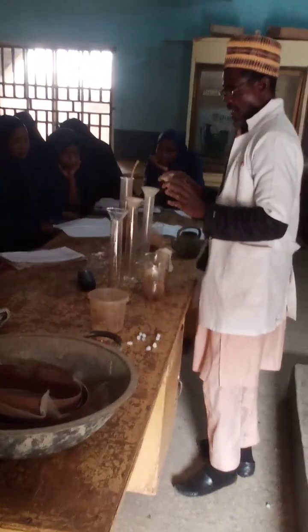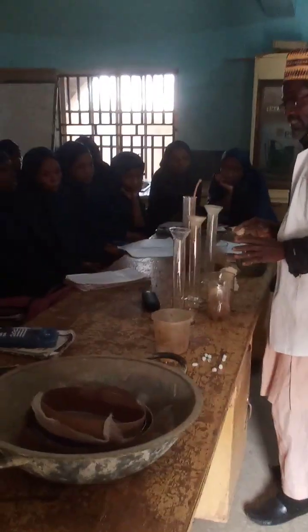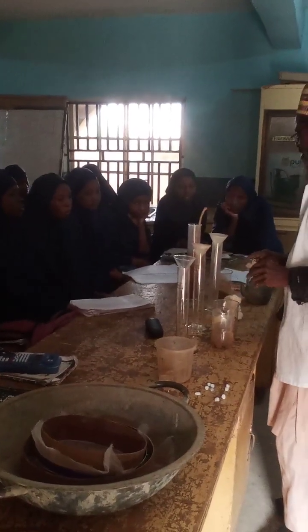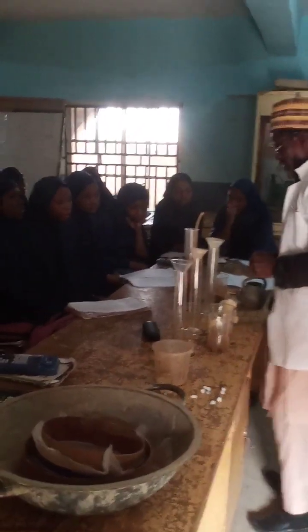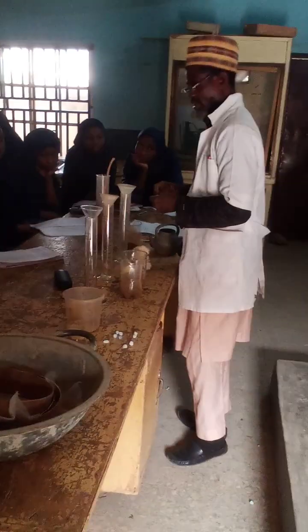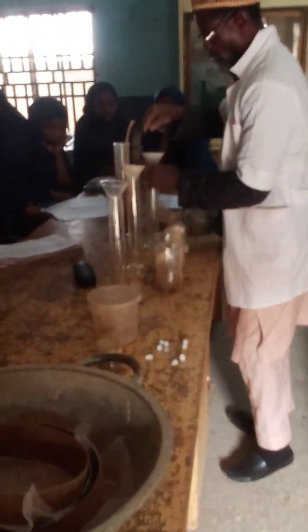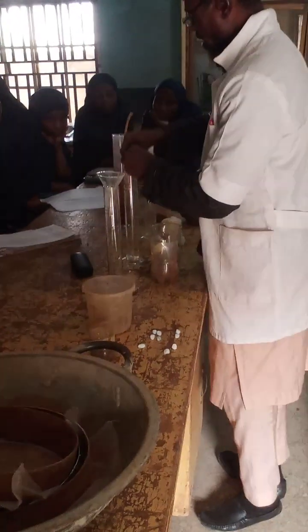In this case, what apparatus do you need for this purpose? The same measuring cylinder. Is that clear? So in that case, you are going to put cotton wool inside the funnel. You need a funnel. Look at it. You put the cotton wool inside the funnel this way.